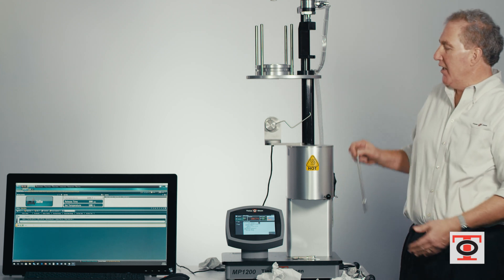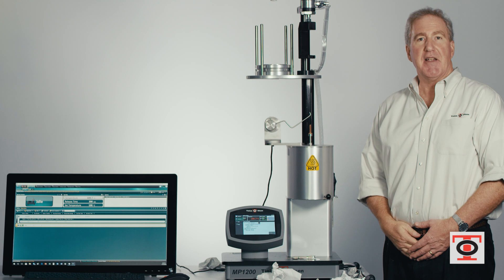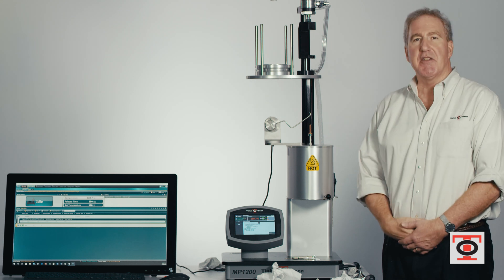After you put the die in, you put your piston back in to make sure it comes to the proper testing temperature before the next test. It takes a couple minutes, but then you're ready to go for the next test.